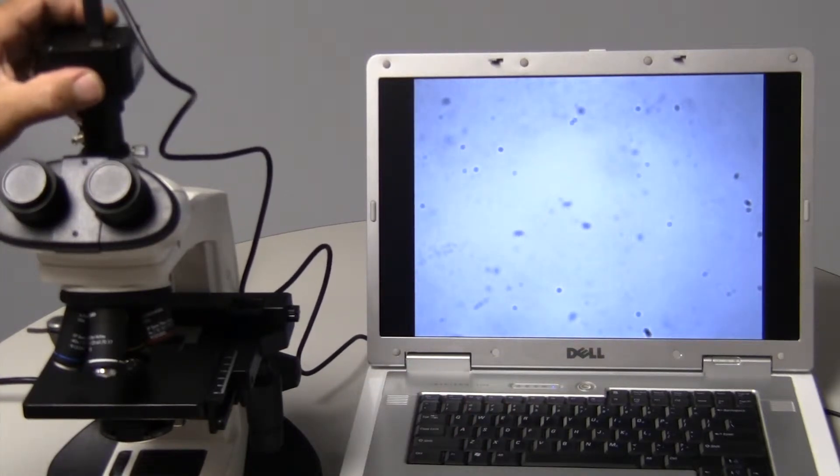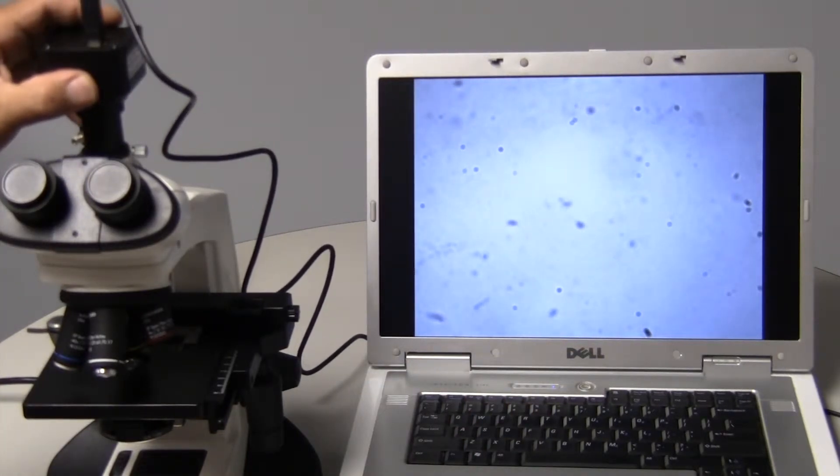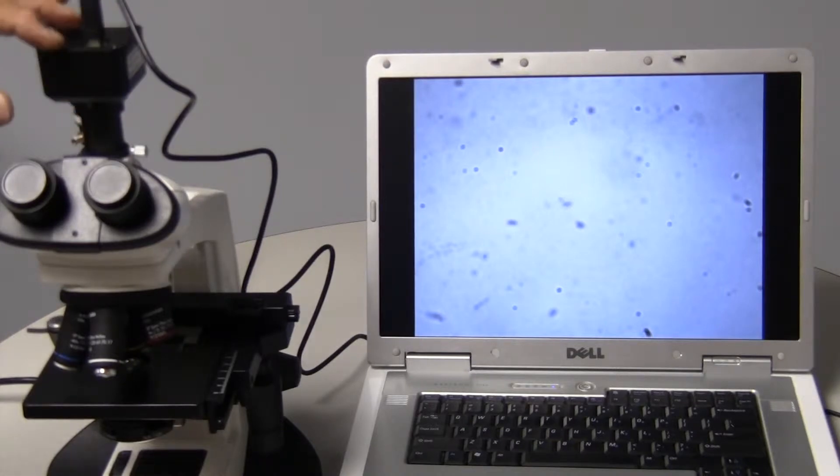Now those pieces of dirt that are in front of the lens are rotating with the camera, so they don't appear to be rotating. The next step we're going to take here is to clean the lenses in the system and show the difference.